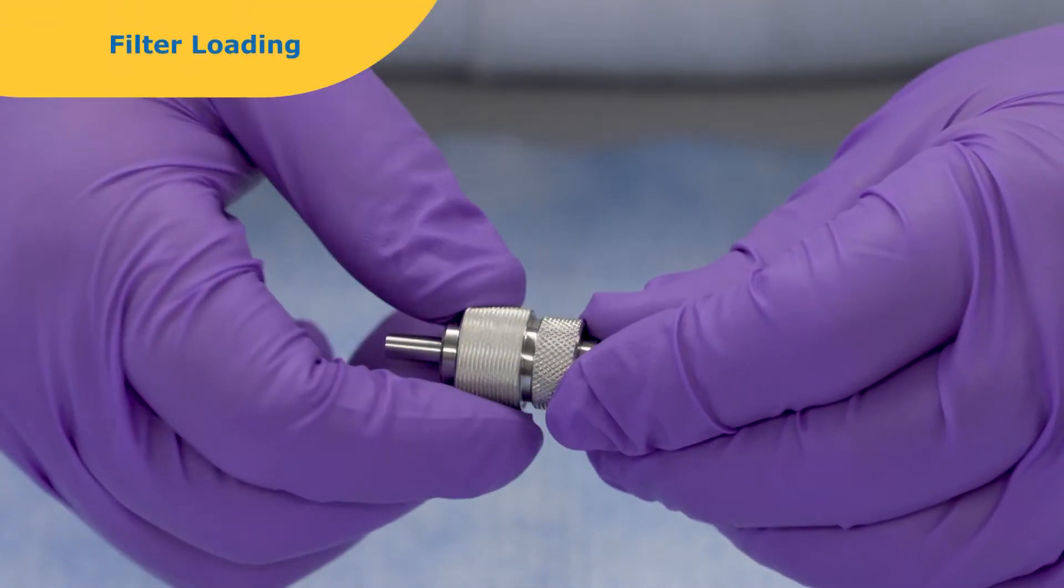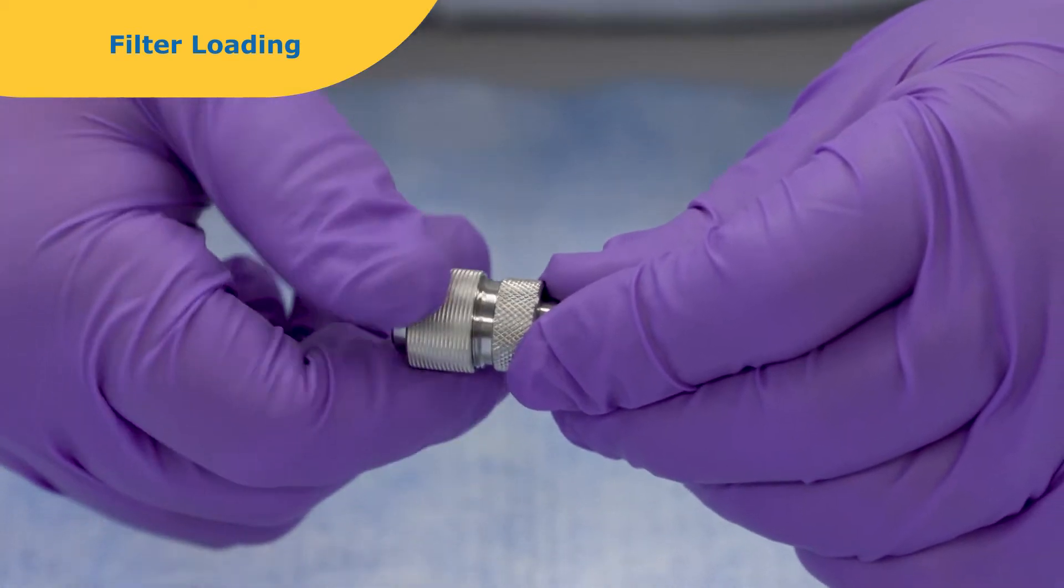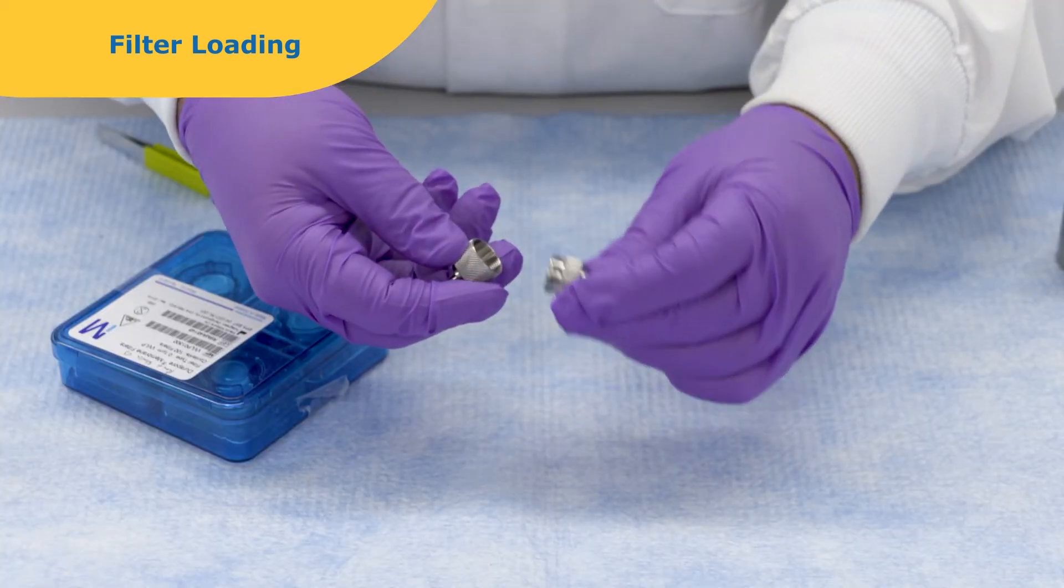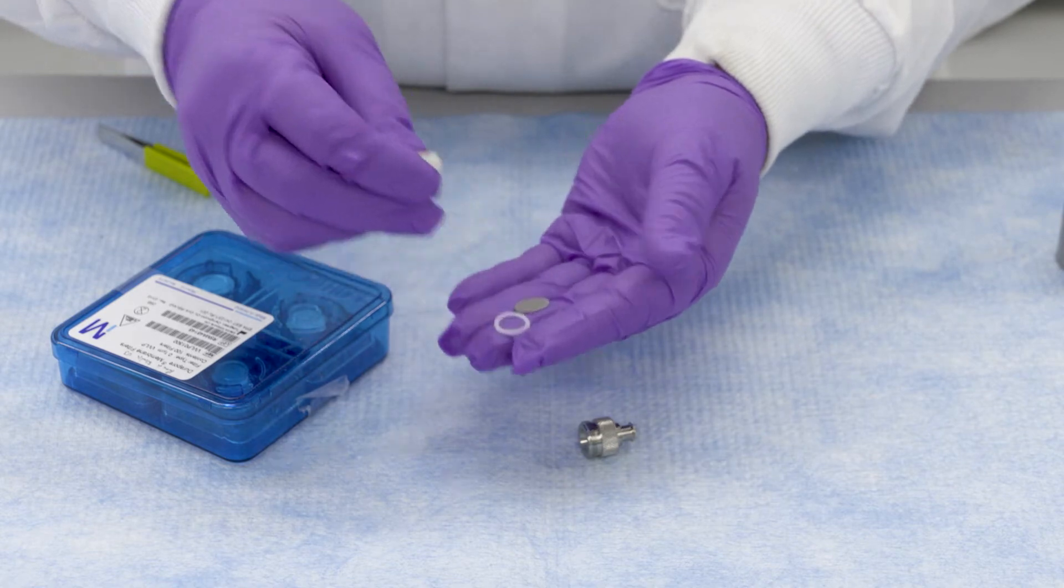To load a filter into the SWINI device, unscrew the inlet cover from the outlet base. Remove the O-ring, support screen, and flat gasket.